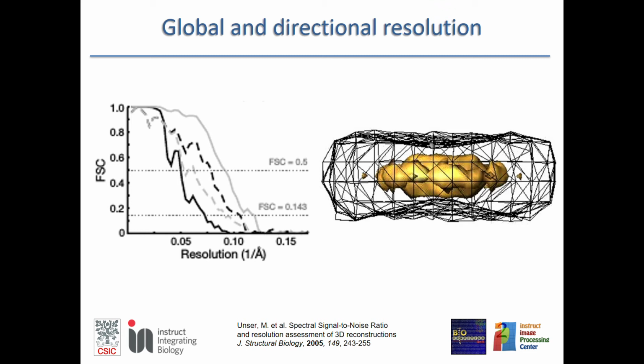And actually, many years ago, 15 years ago, we suggested a way to compute the spectral signal-to-noise ratio in any direction. That means Fourier correlation and signal-to-noise ratio are very much related quantities. The specific relation may not be analytical. The analytical relationship that we normally find comes only after a lot of simplifications, but they are related.